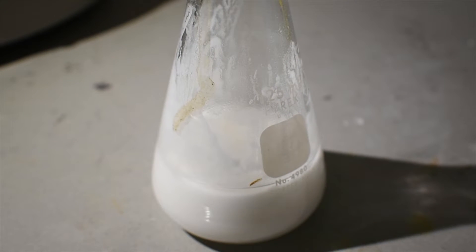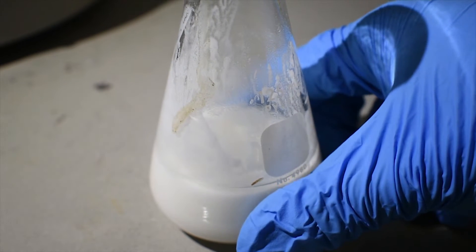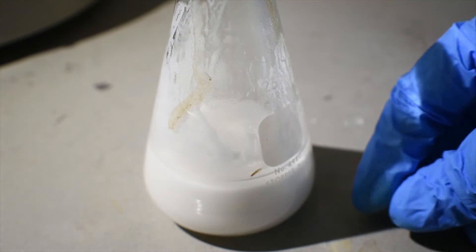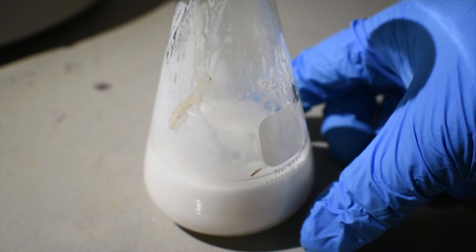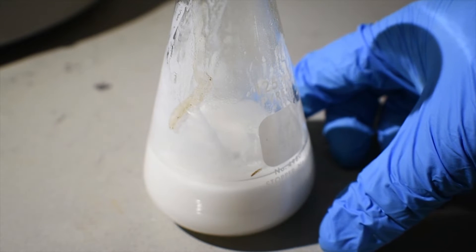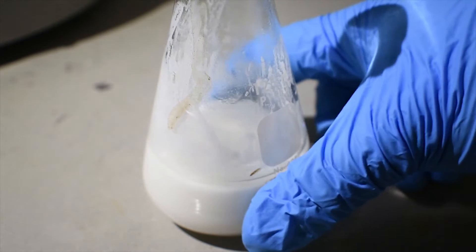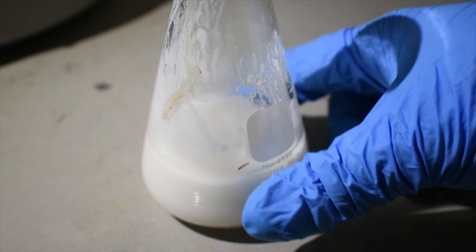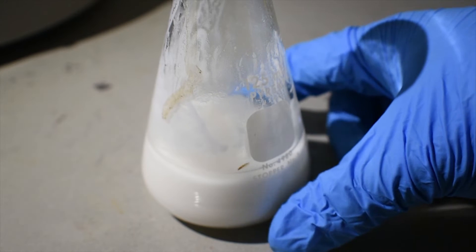Now we have a thick precipitate of the trimethylborate ammonia addition compound. This is almost too hot to touch. Some of this heat probably comes from the reaction of residual sulfuric acid with the ammonia, and possibly some reaction of any residual boric acid with the ammonia as well.